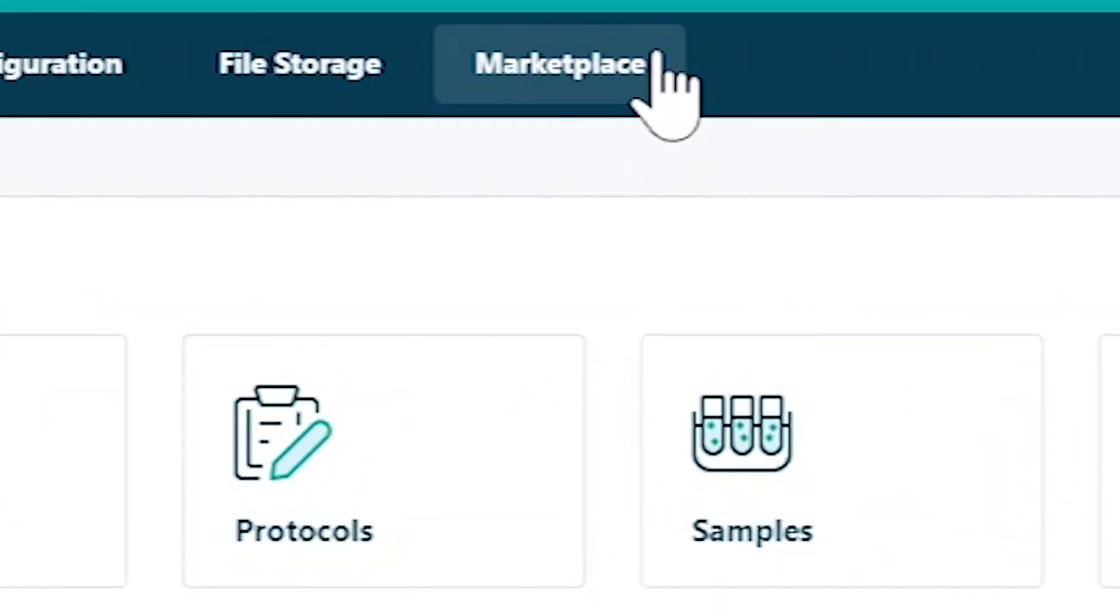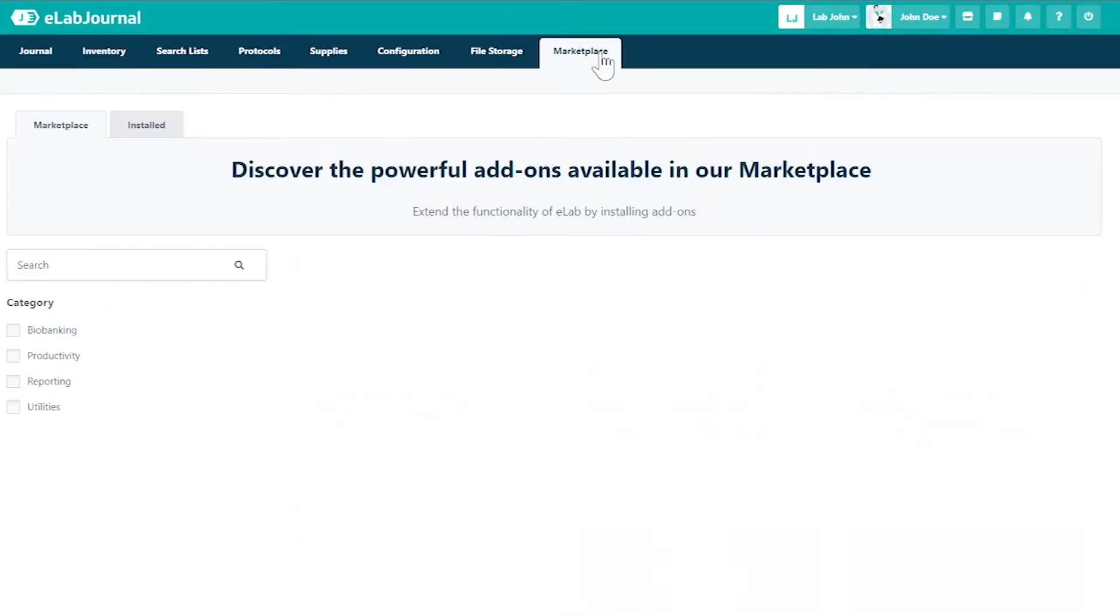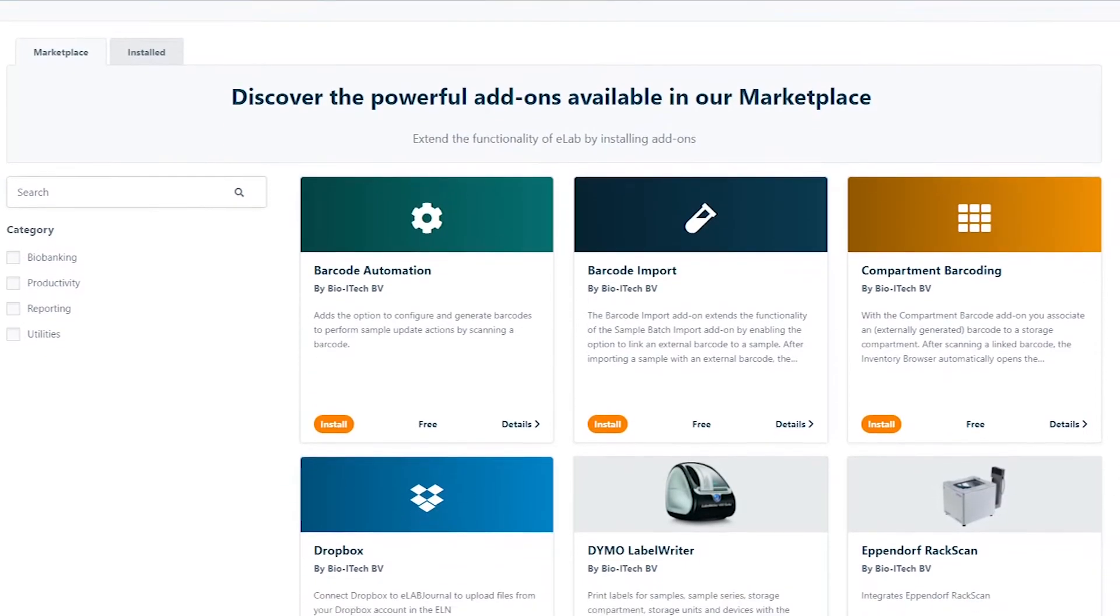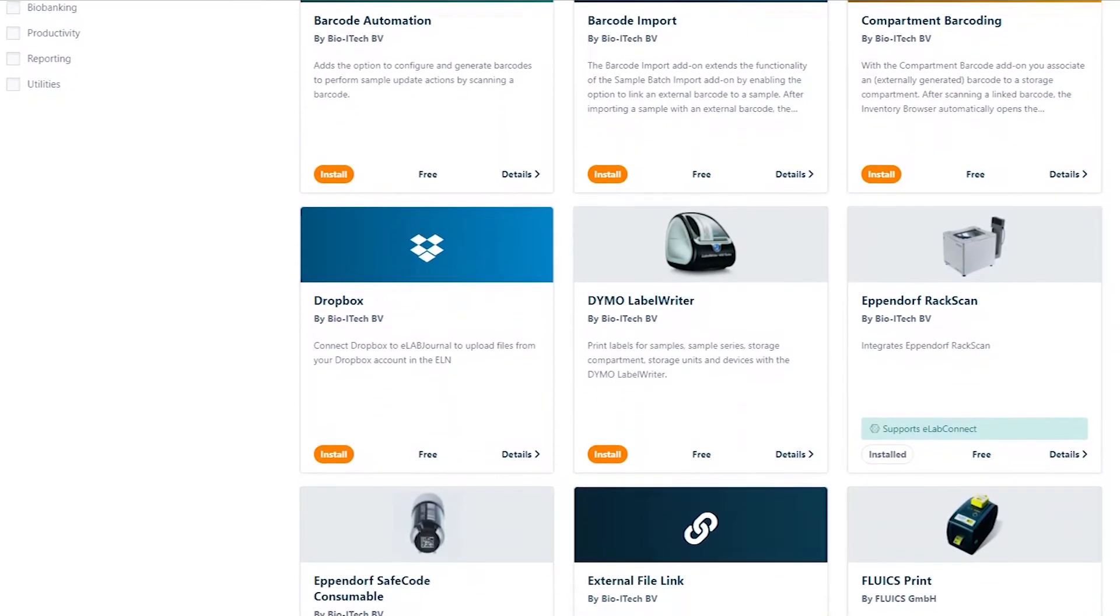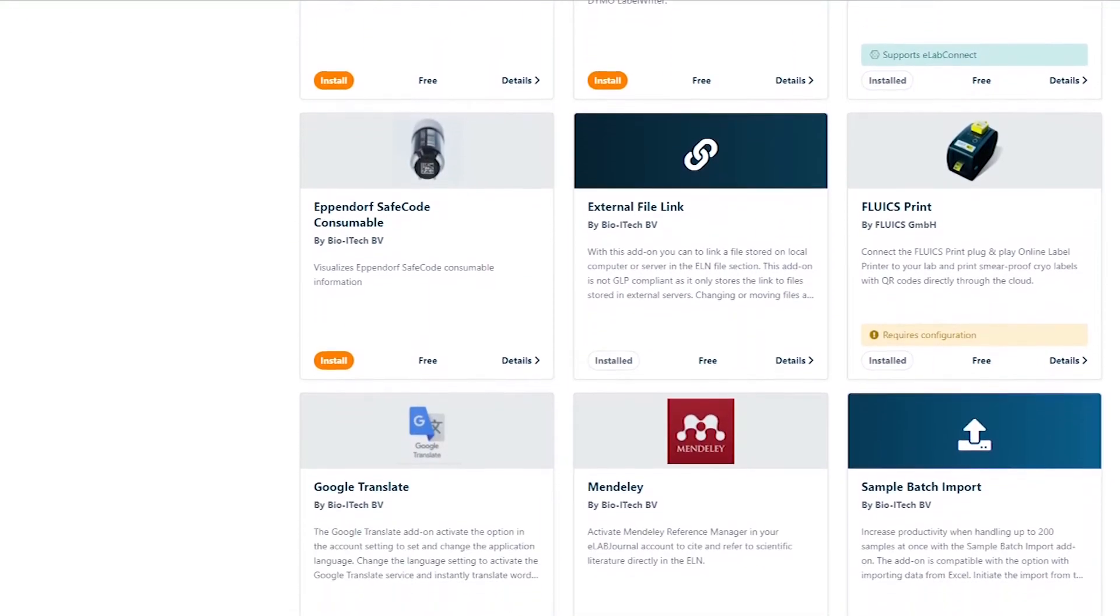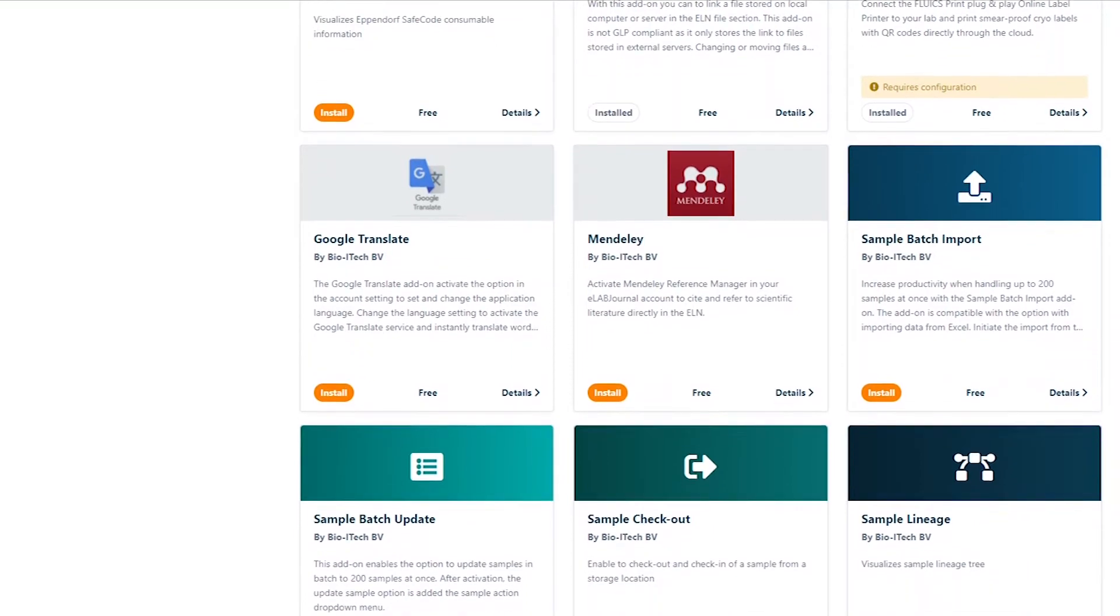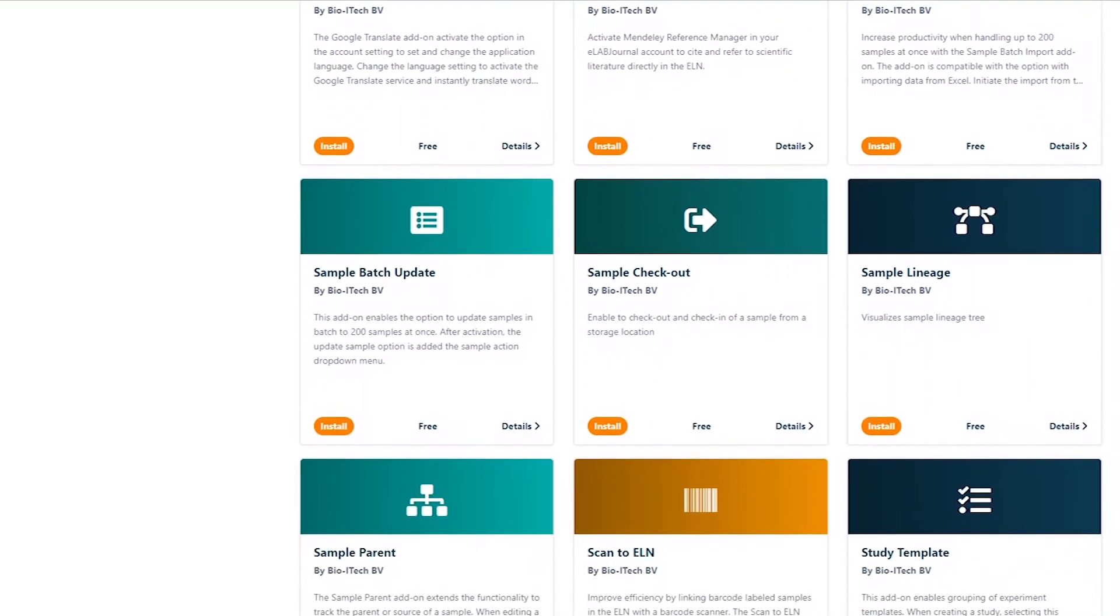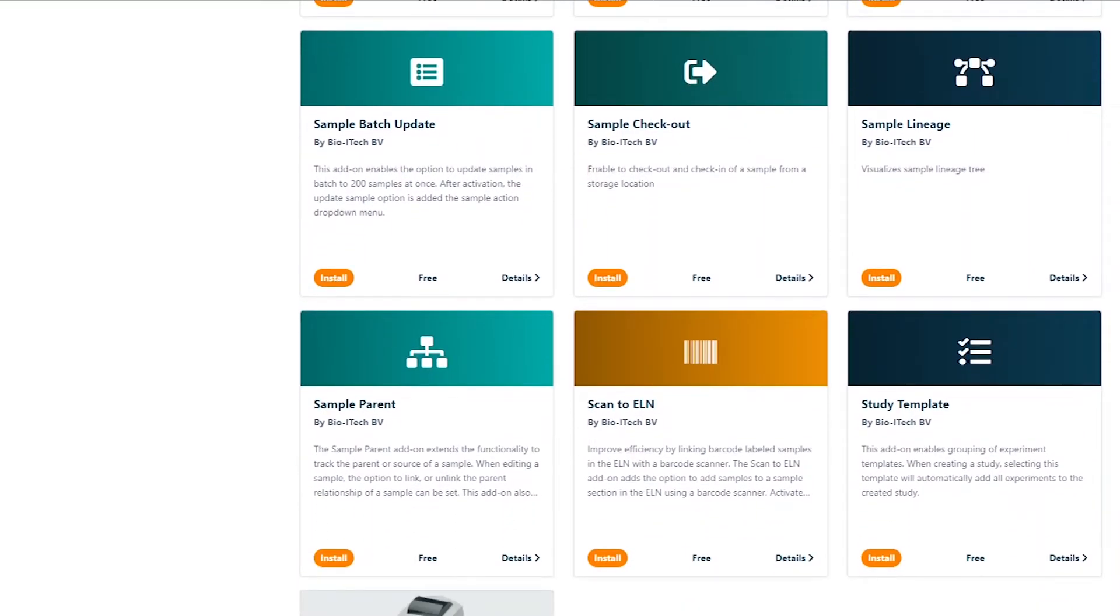Begin by selecting Marketplace from the dashboard menu. Here you'll find all available add-on integrations. Most add-ons are free to install and cover a range of categories. Installation is a quick and simple process.